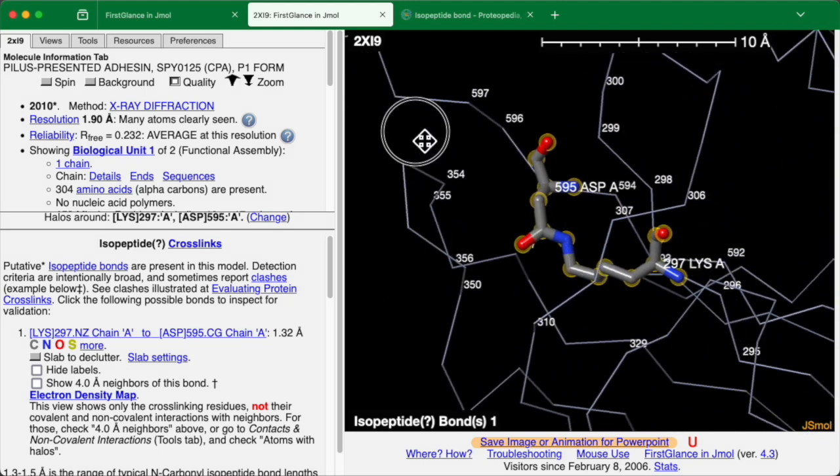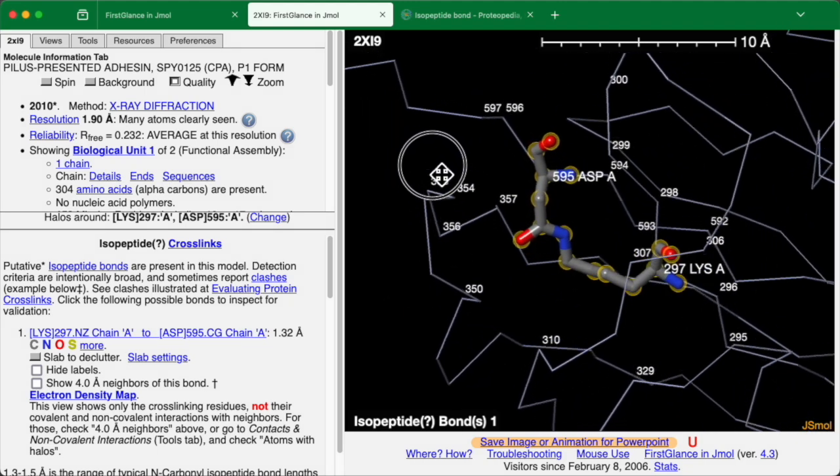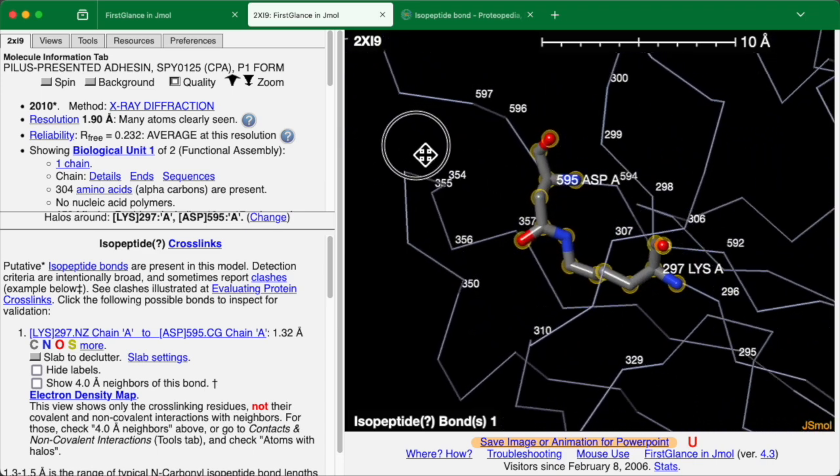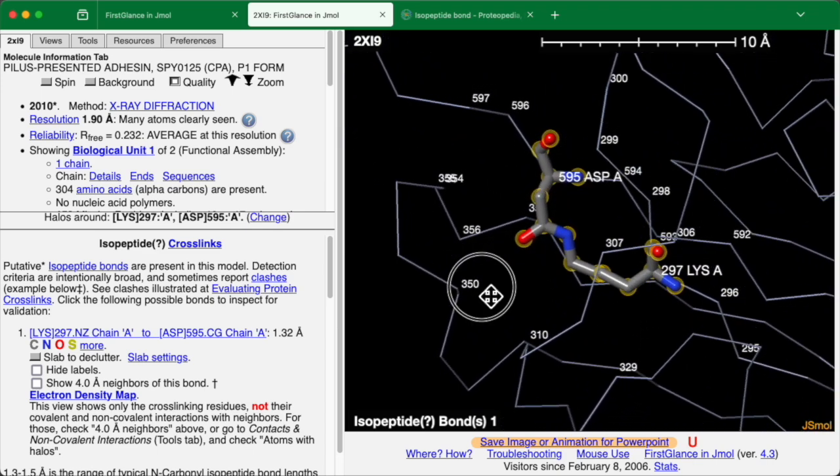Okay, this looks like an isopeptide bond. It looks legitimate. Nothing suspicious about it. How do we verify if it's real?